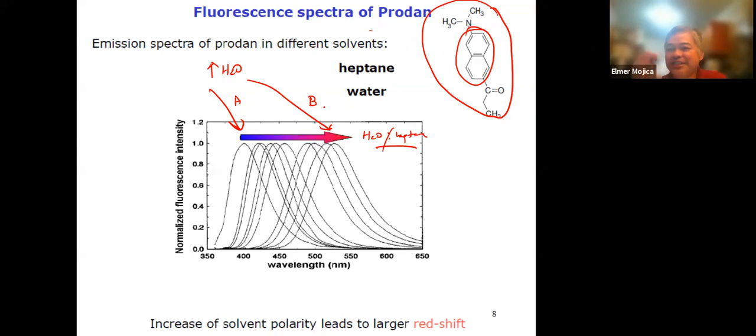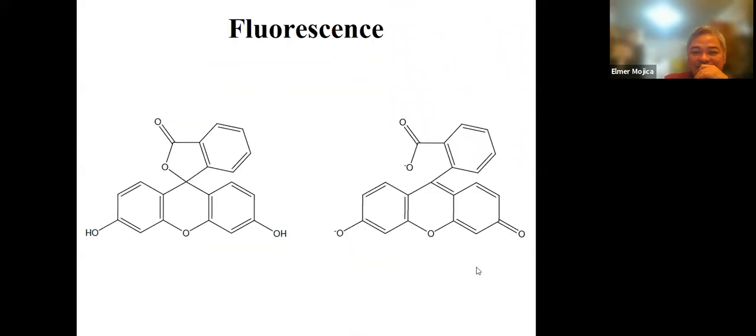And you know, it's really what we call a very simple experiment. Ang ginagawa nila, they just vary the composition of a polar and a non-polar solvent. So yan yung na-observe nila sa product. Okay? Now, the example that I can give you, ito yung tinatawag nating fluorescent.